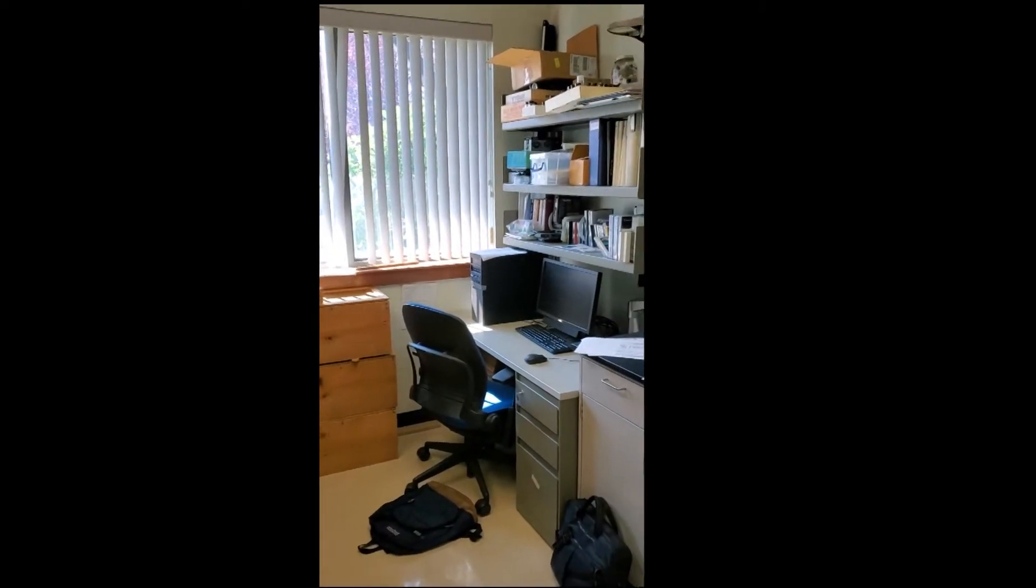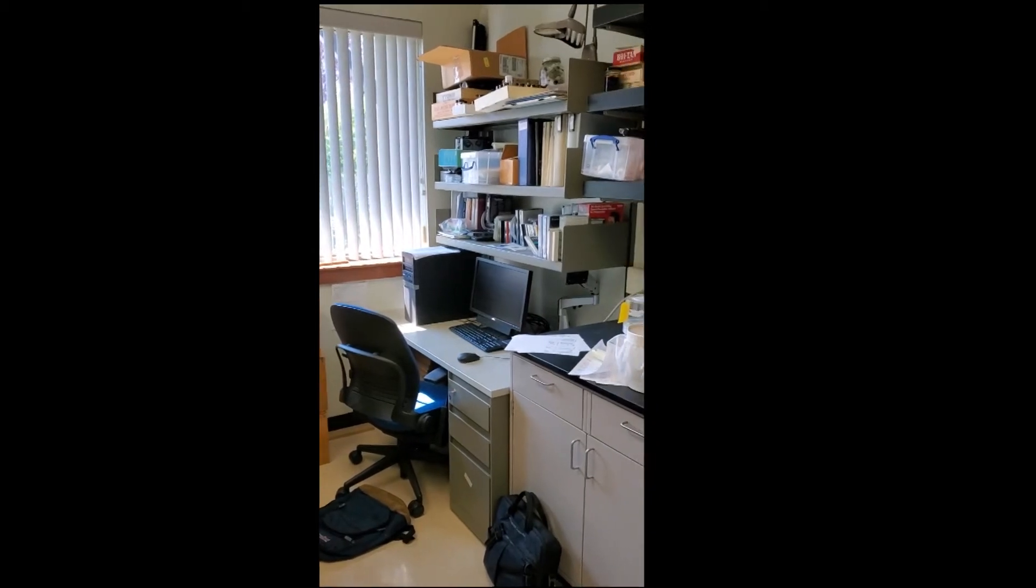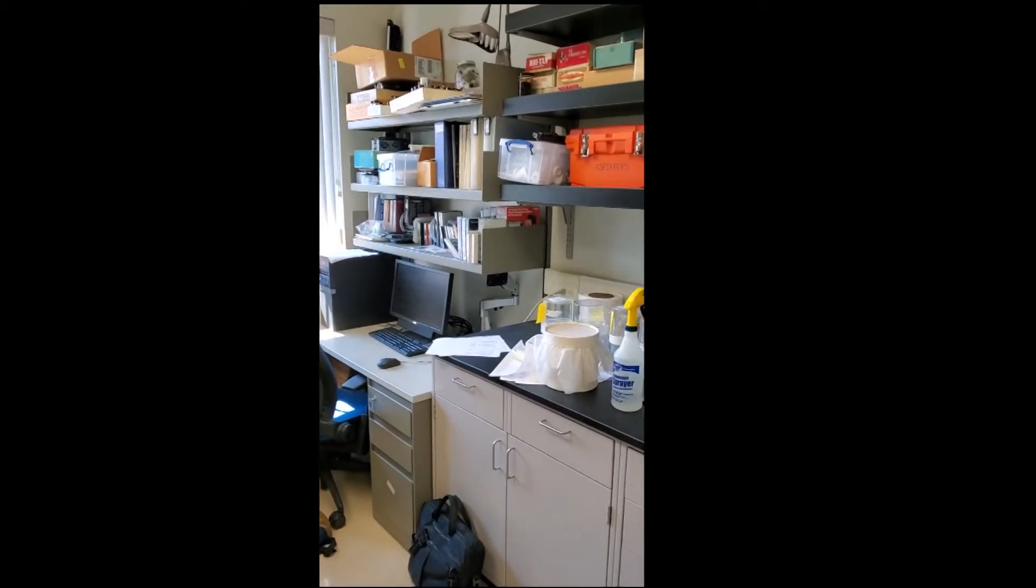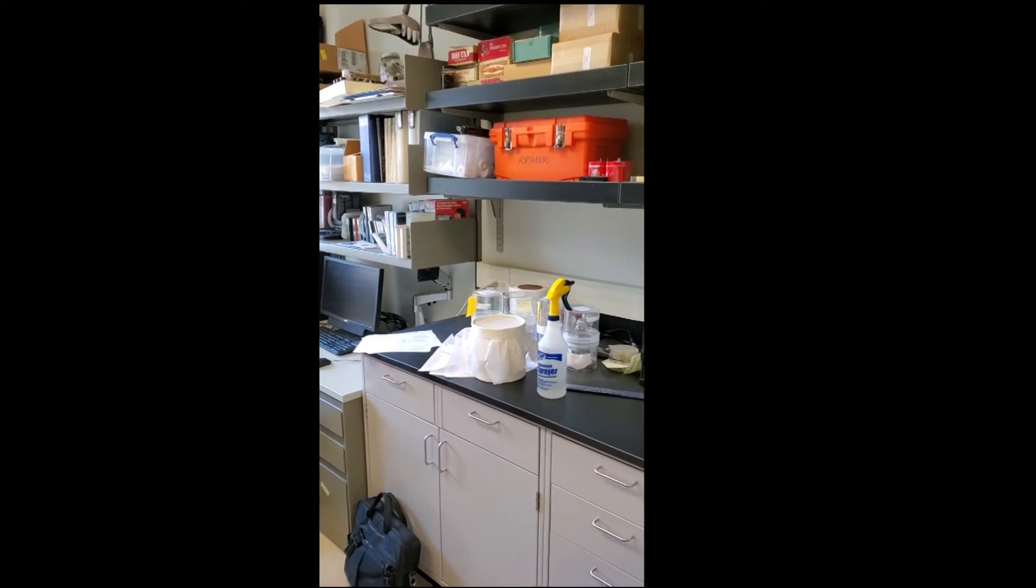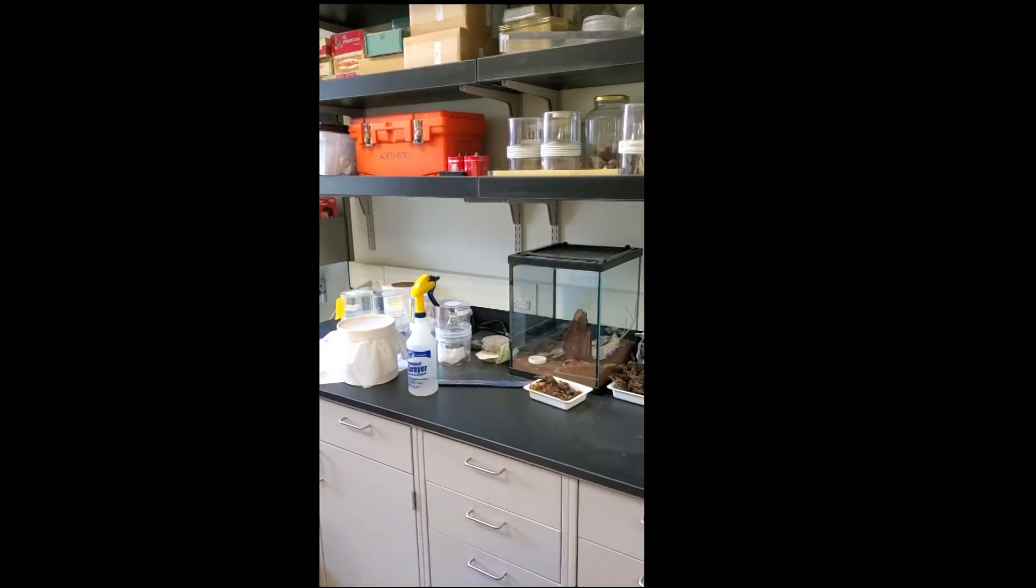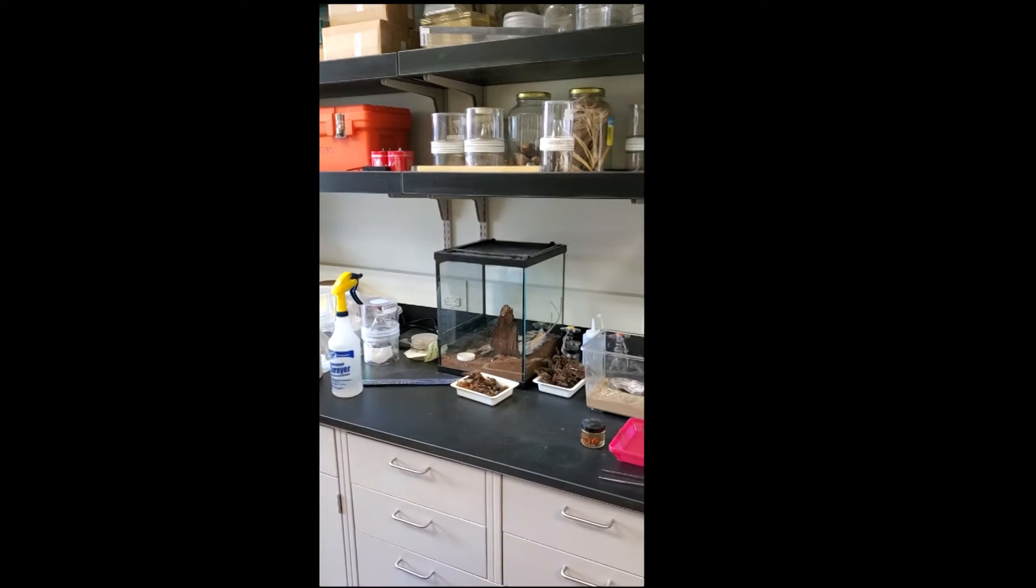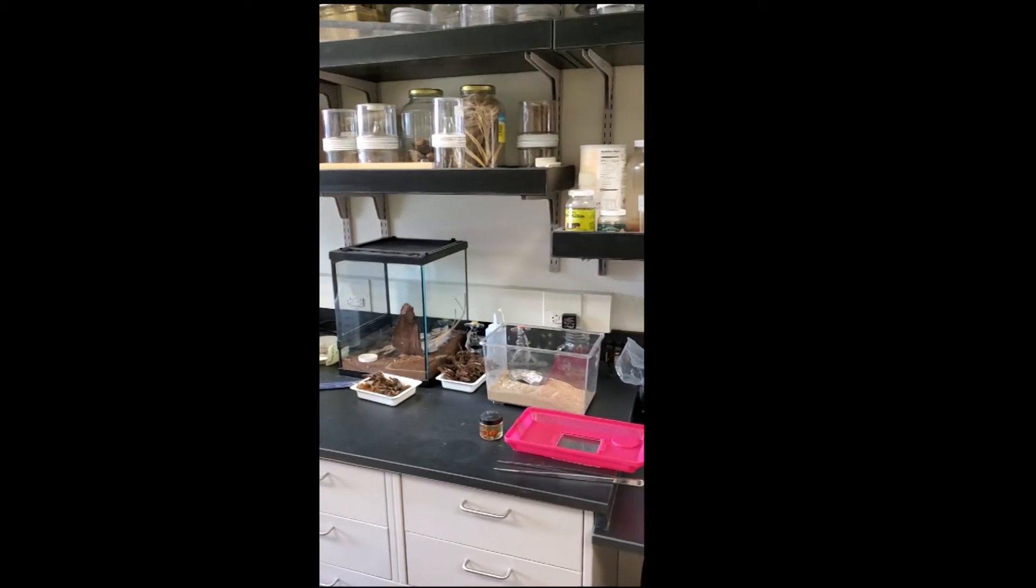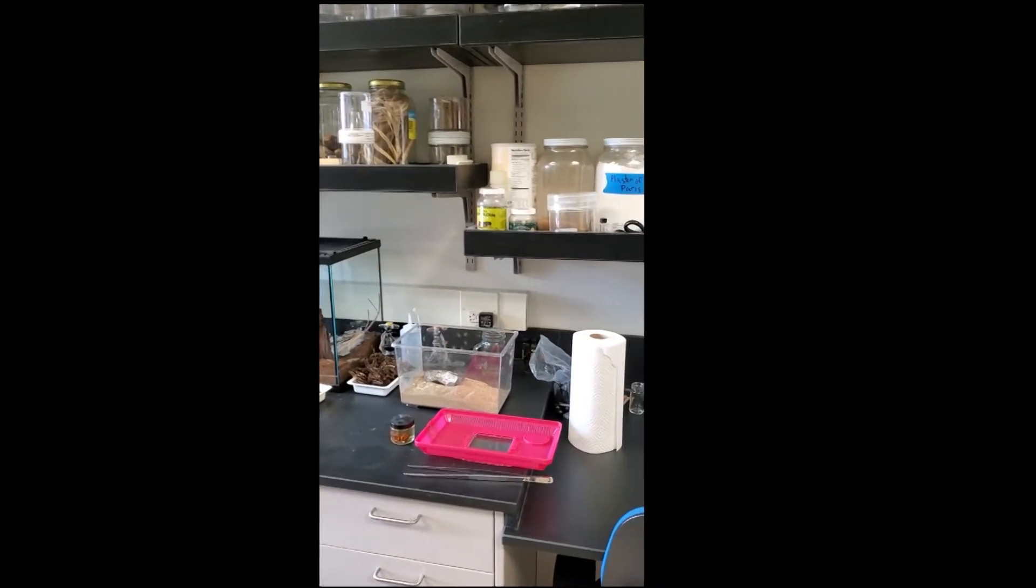So that's what we do here. The desks are for our seasonal employees that work on our surveys and things like that. And you can see the cages we have. This is one of our tarantulas and some other insects that we keep in here.